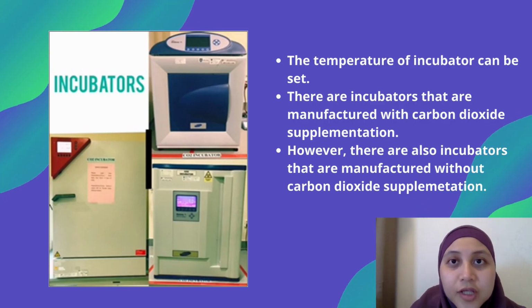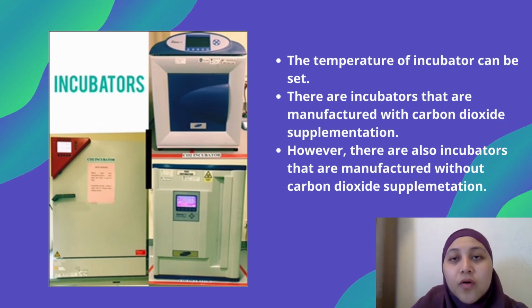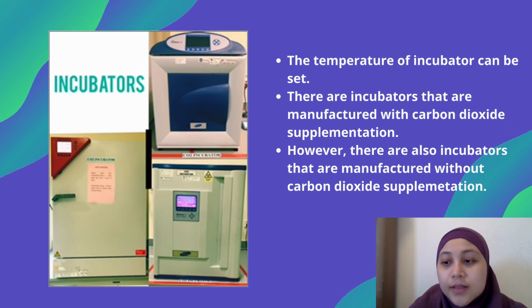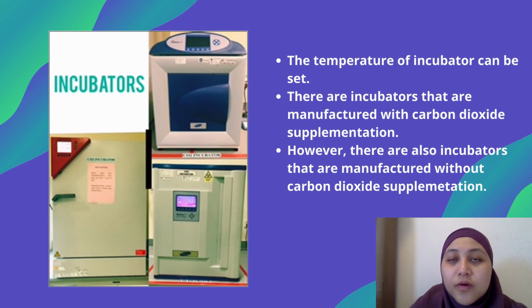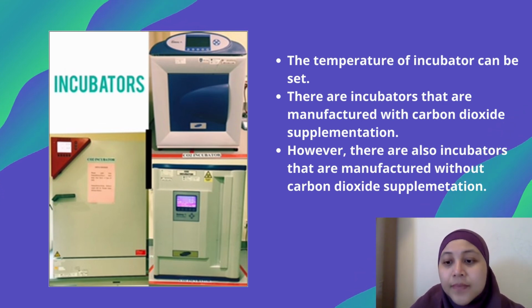So this is the picture of incubator. Incubator mimics the human body for cell culture study. So there are many types of incubators. Most human cells require 37 degrees with 5% carbon dioxide supply for growth and maintenance.